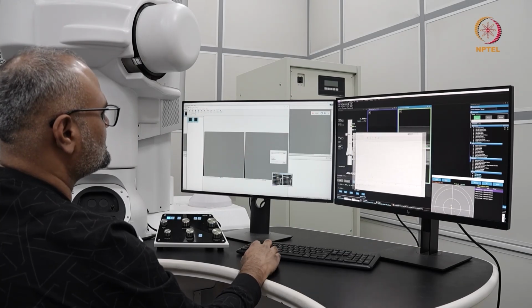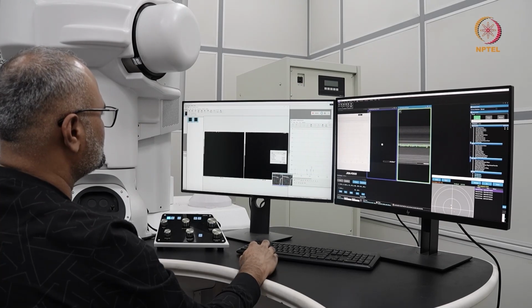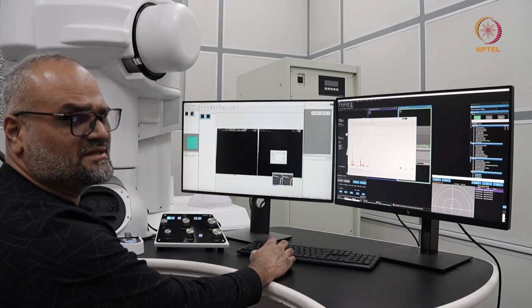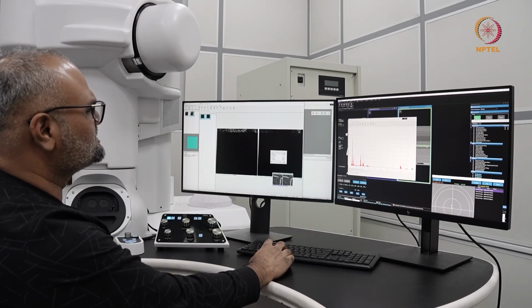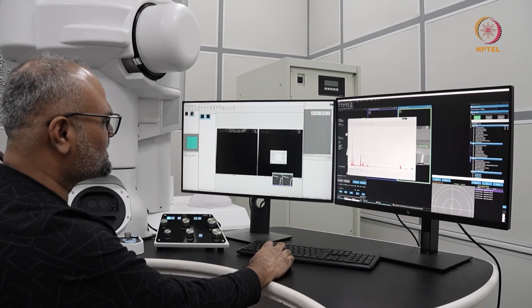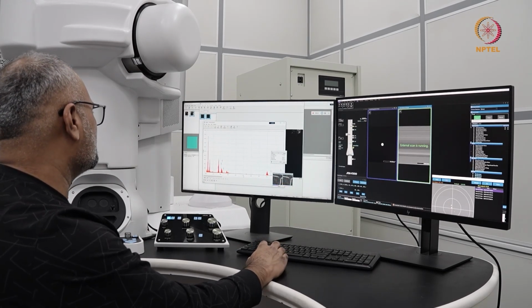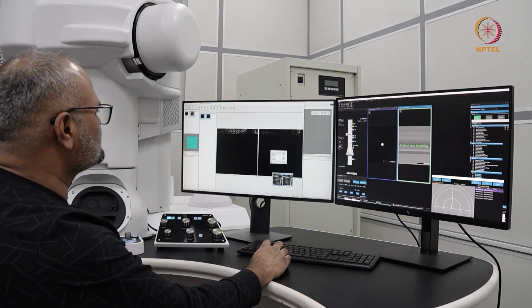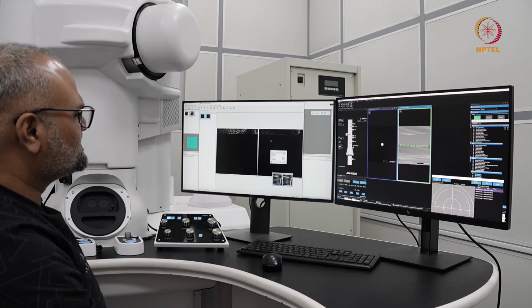and it starts forming the image. To obtain the STEM images, we were previously using an aperture size of 40 microns. In order to obtain a good EDS signal, I switched to the 100 micron aperture, centered the aperture again, and as you can see, the counts are pretty prominent now, and the scan is going on here, and this is how you actually obtain an EDS map.